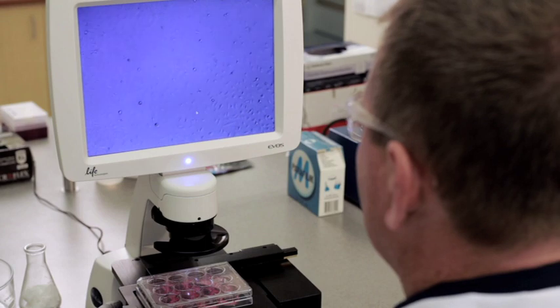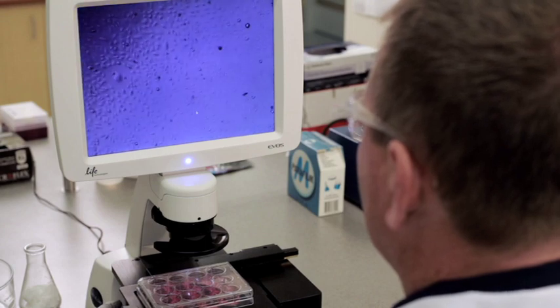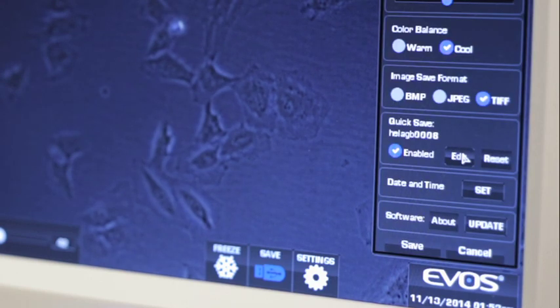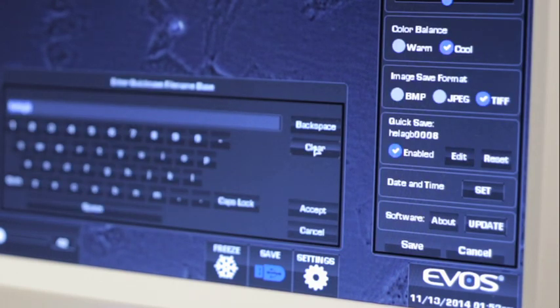The quick save enables a base file name to be established in which all images will be numbered in the order in which they were saved. To set up the base file name, go into the settings menu and select edit in the quick save section.